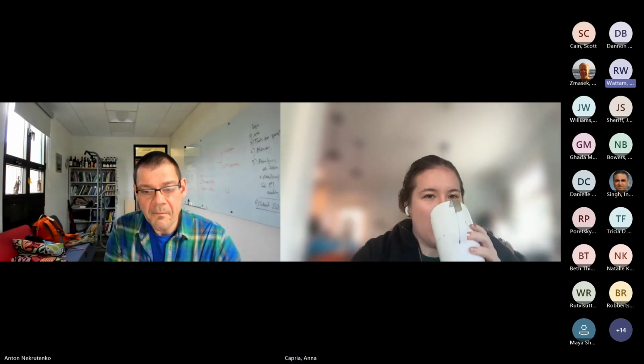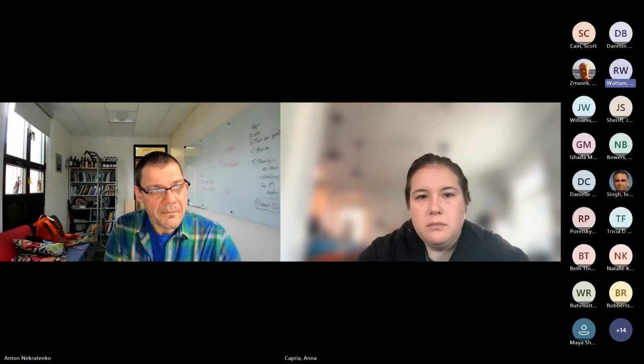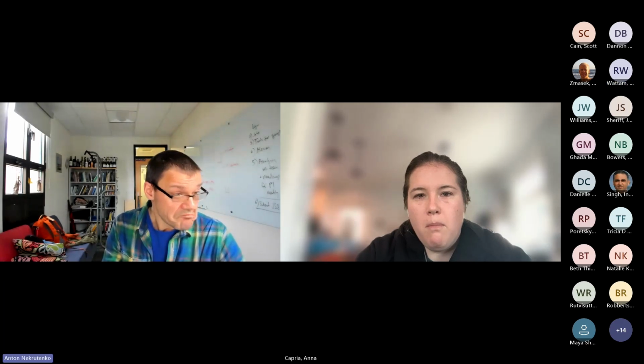I was just curious, those datasets were large. How long did that whole thing take to run? So you mean the RNA-seq analysis? Yes. 15 minutes, half an hour.